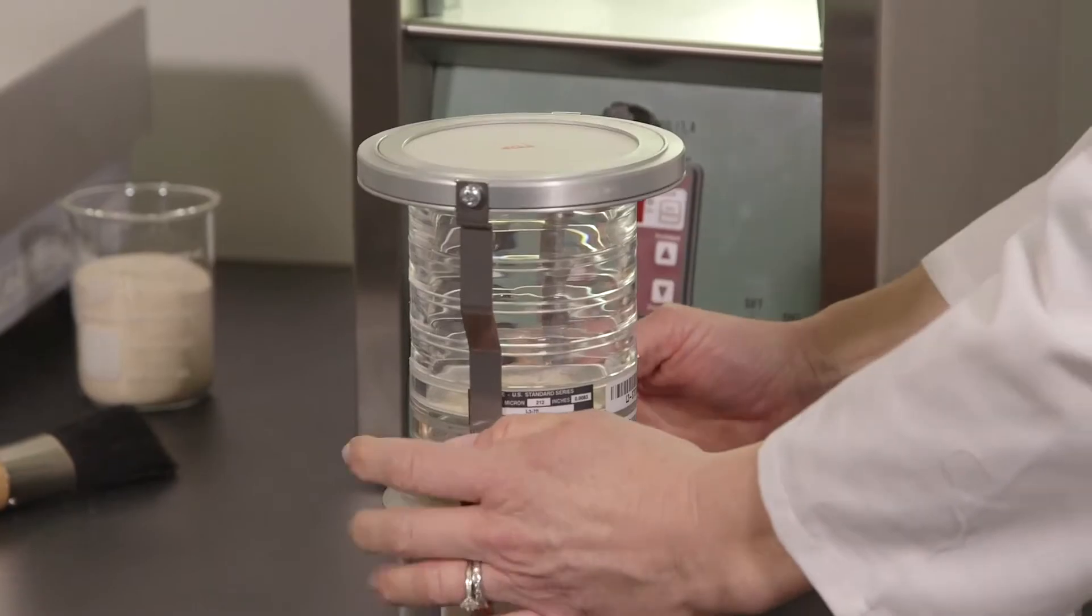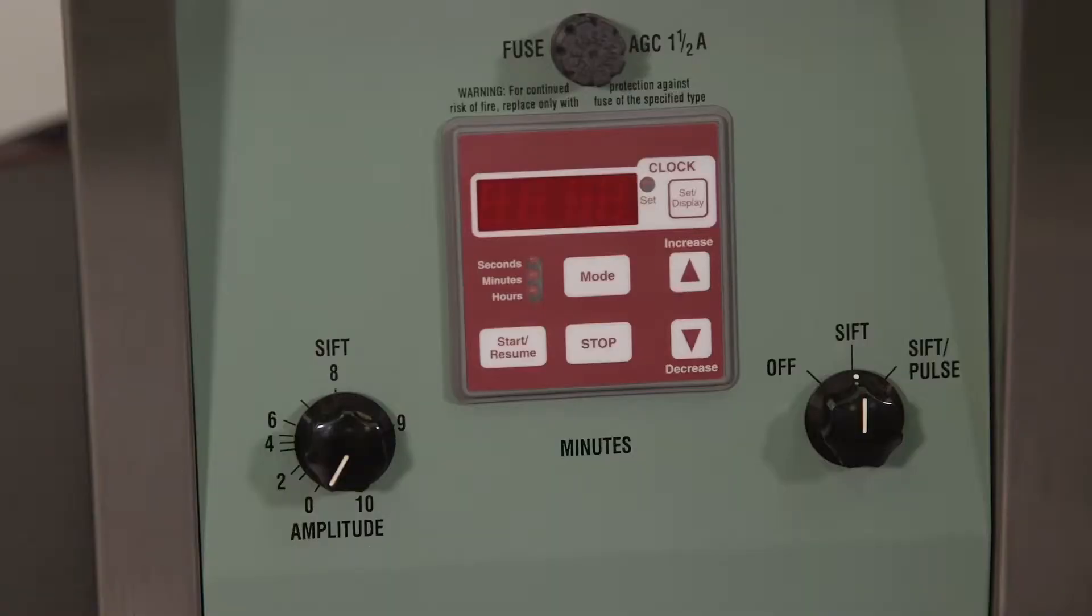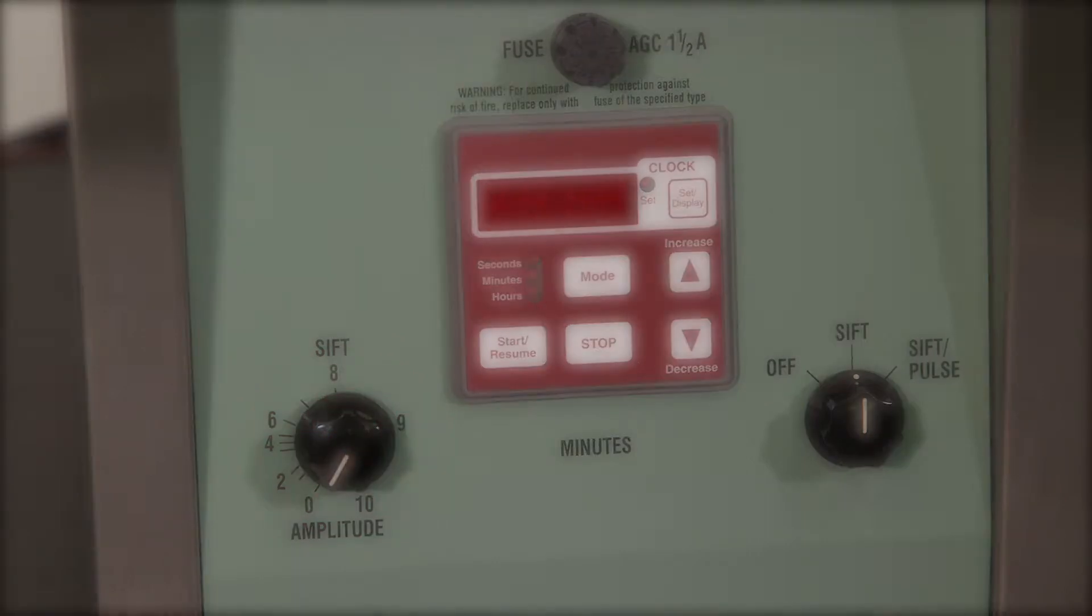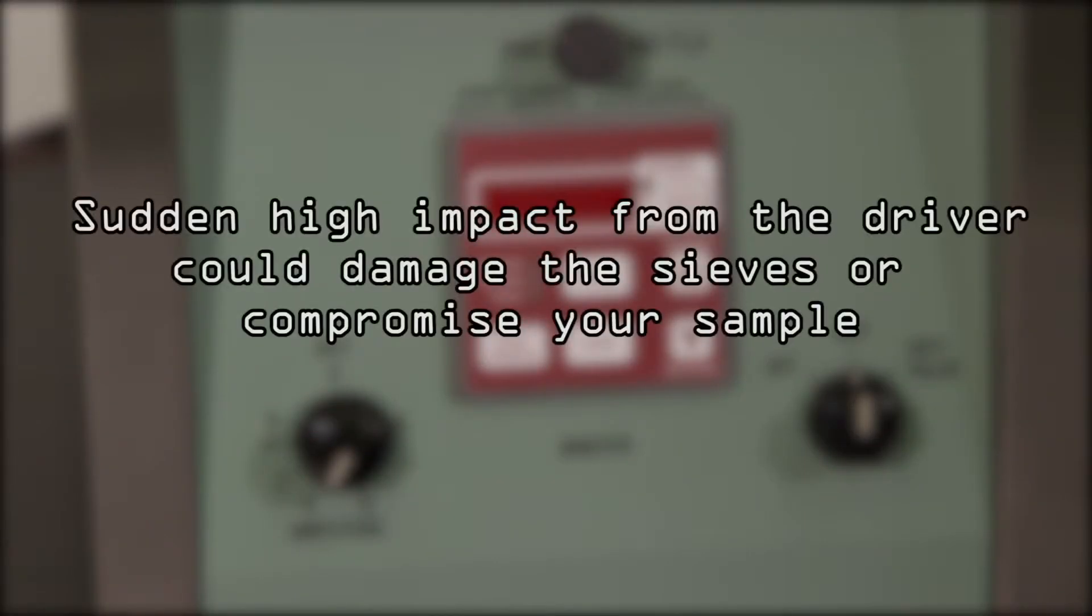Refer to Chapter 6 of Test Sieving Principles and Procedures for tips on determining optimum sample size. Install the diaphragm. When properly oriented, the word top will be visible. Clip everything together with the column lock.